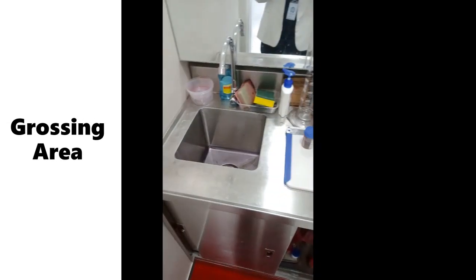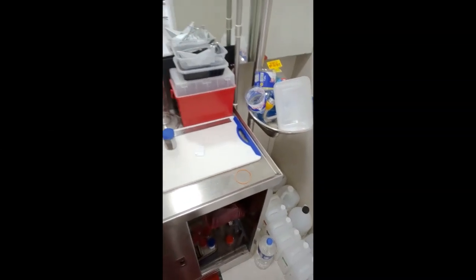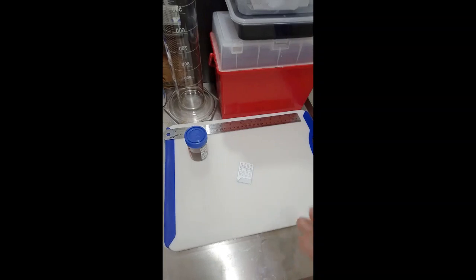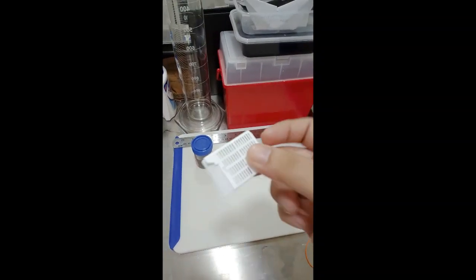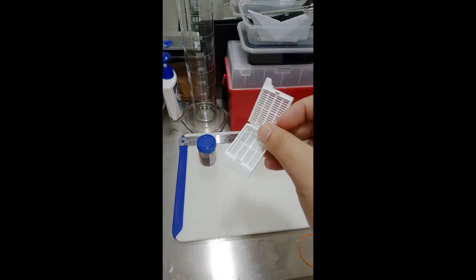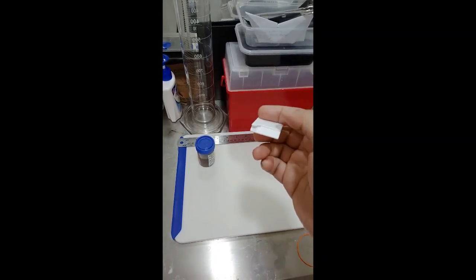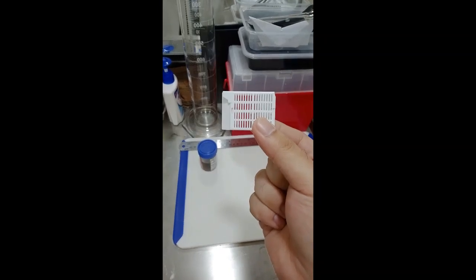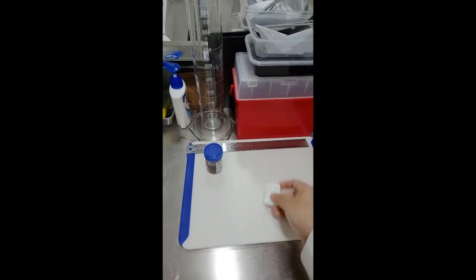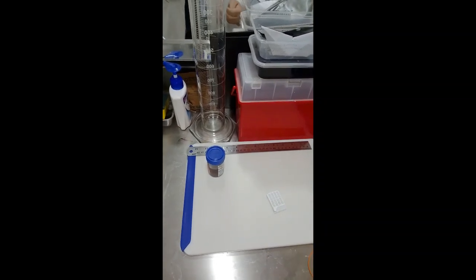Okay, so this is a typical example of a grossing area. In the grossing area, tissue samples are dissected and cut into small pieces so they can fit inside these tissue cassettes. As you can see, this is our tissue cassette. These can be opened so that the representative section of the tissue can be placed inside. You close it, you put the label here with a pencil, and then this is ready for tissue processing. So who does the gross examination, or the grossing? This is usually done by our histotechnologist or whichever pathologist is available.